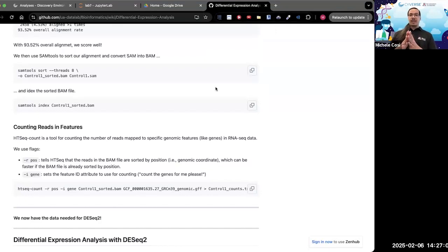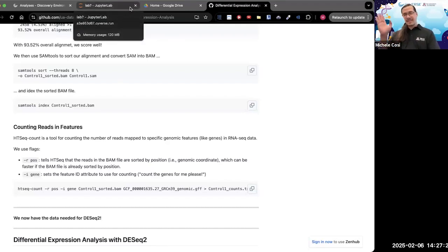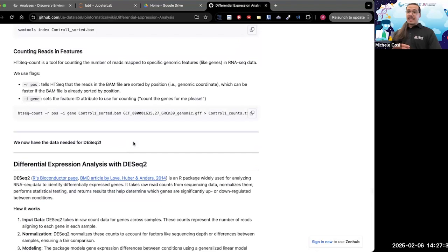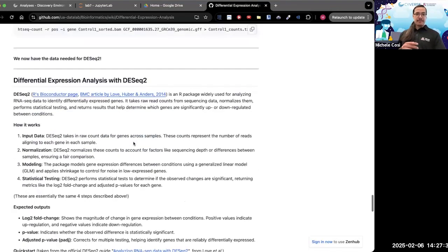If you remember, last week we ended with a text file, a really long text file with all of the potential genes that were present and their position. And I said, don't open it because otherwise you won't be able to read it and things are going to break. Or whatever I said, I'm not really sure. But I needed to go through what we did last week and give you a little bit of understanding on the fold change before we jump into using DESeq2.